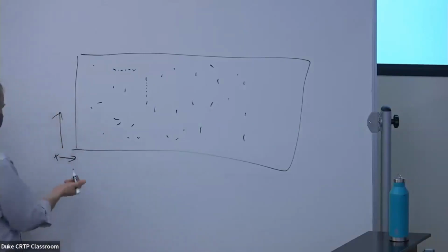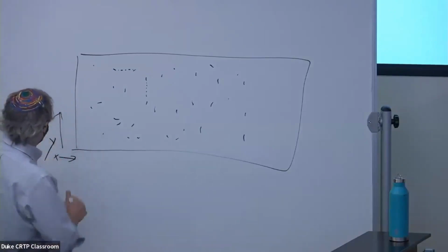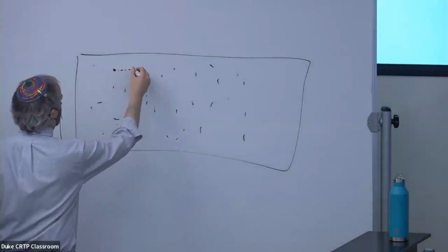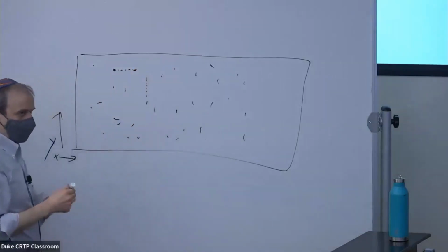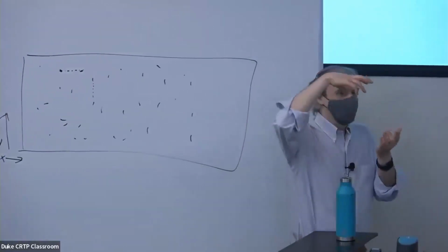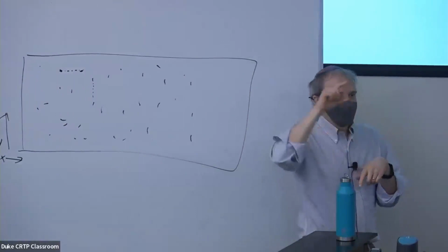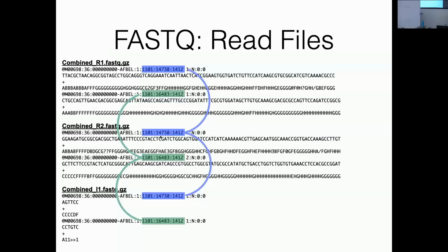I was looking, I was like, they're both X. I swear that's a Y. So these two spots have the same Y coordinate, different X coordinate, right? So yeah, the reads from one spot should have identical tile, X and Y coordinates. Right, so these are like unique addresses.